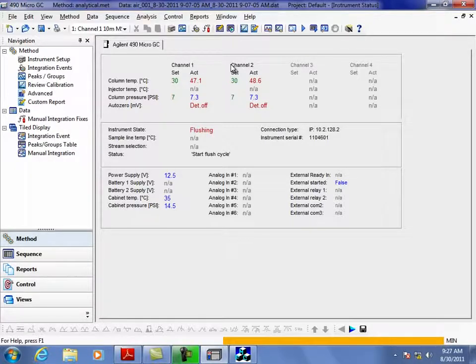If you buy a standard, it's going to be under pressure, and you just need to make sure you never put more than 15 psi on it. Hook it up, and with the suction pump and that positive pressure on the back, you get very nice reproducible results.